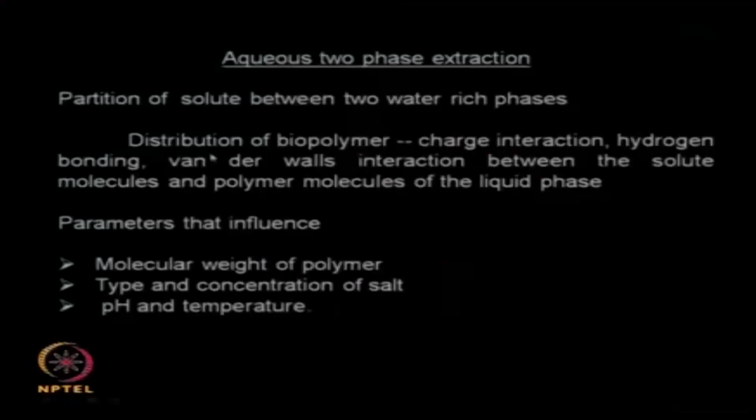We add something called a biopolymer. The biopolymer in aqueous medium may interact with the protein of our interest. These are called non-bonded interactions. The interactions could be because of charge, hydrogen bonding, or van der Waals interaction between the solute molecule or protein and the polymer molecules in the liquid phase.